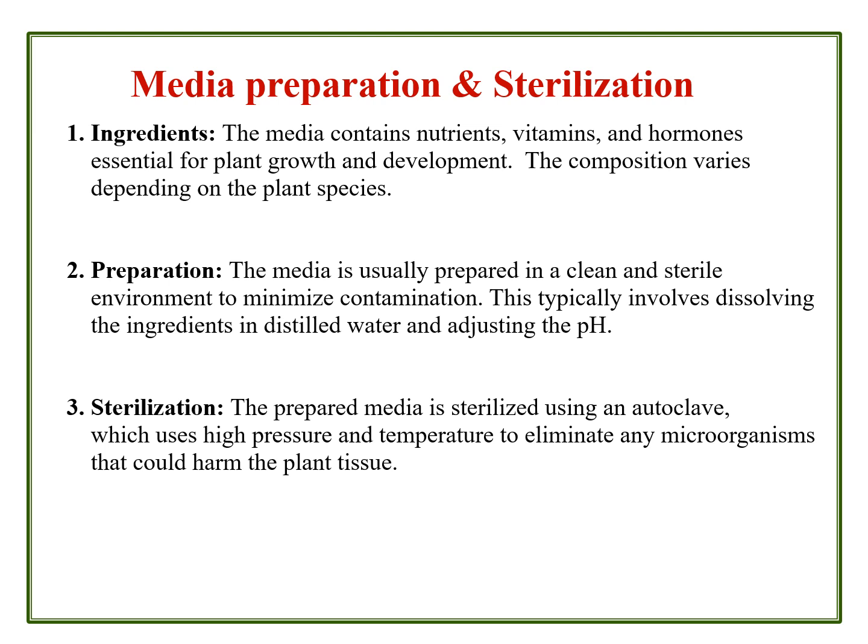Now let us see what the media is and how the media will be sterilized. All the media contain nutrients, vitamins and hormones essential for plant growth and development, which are incorporated or suspended into distilled water, and the composition varies depending on the plant species. Every time, based on the plant species, you have to design the components, especially vitamins and hormones, right?